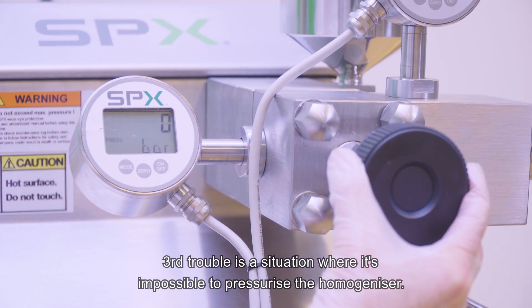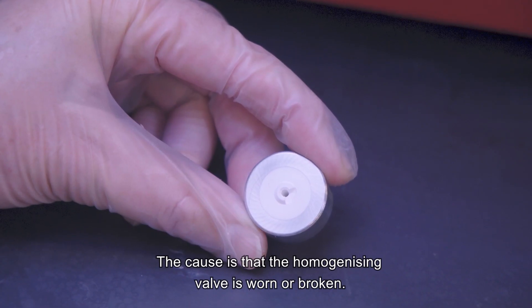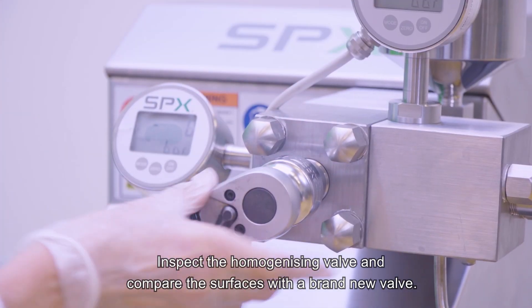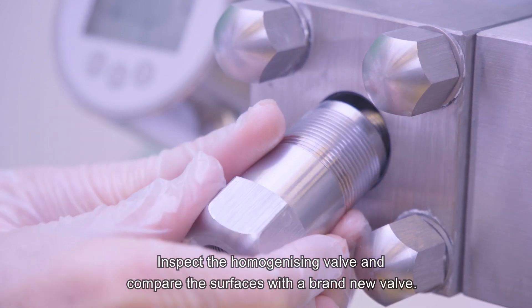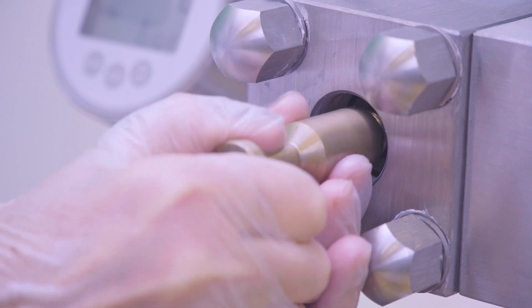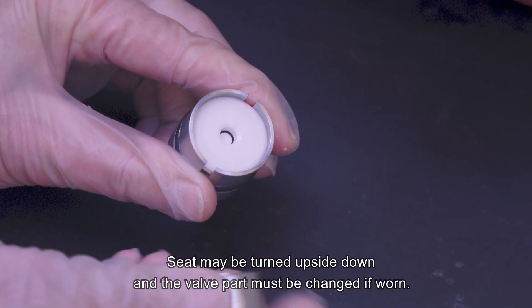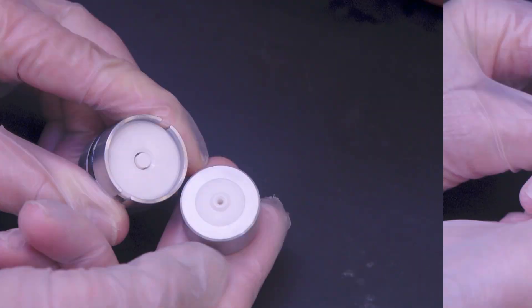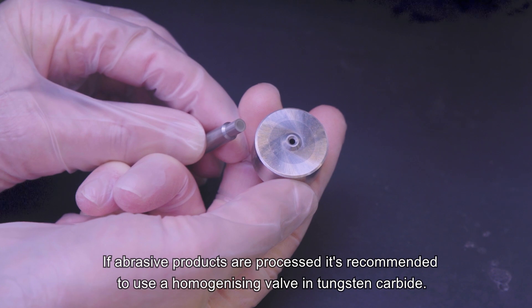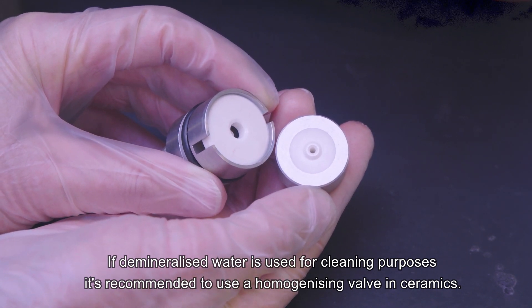The third trouble is a situation where it's impossible to pressurise the homogeniser. The cause is that the homogenising valve is worn or broken. Inspect the homogenising valve and compare the surfaces with a brand new valve. The seat may be turned upside down, and the valve part must be changed if worn. If abrasive products are processed, it's recommended to use a homogenising valve in tungsten carbide. If demineralised water is used for cleaning purposes, it's recommended to use a homogenising valve in ceramics.